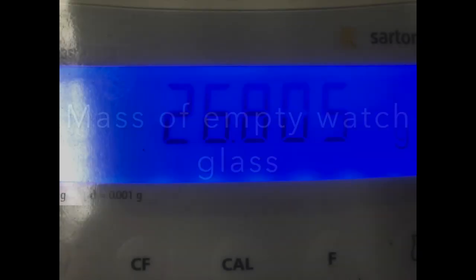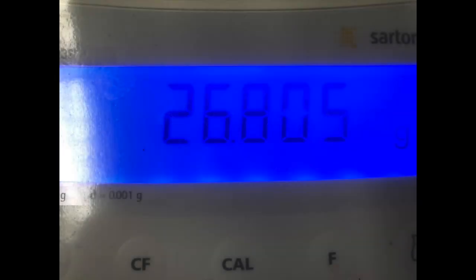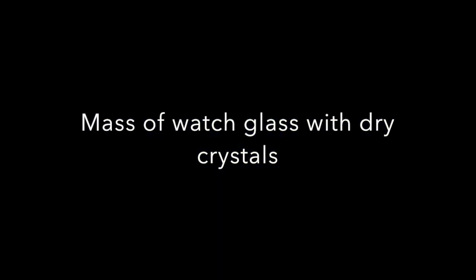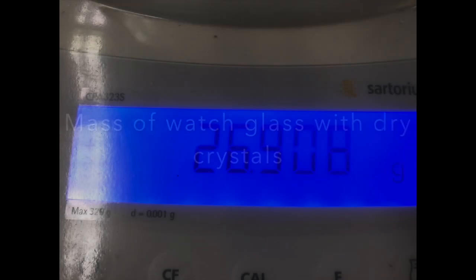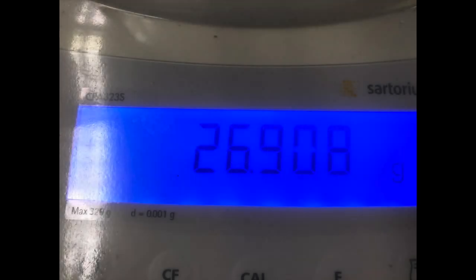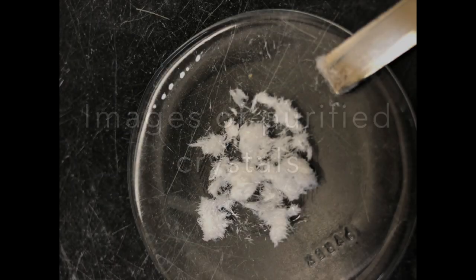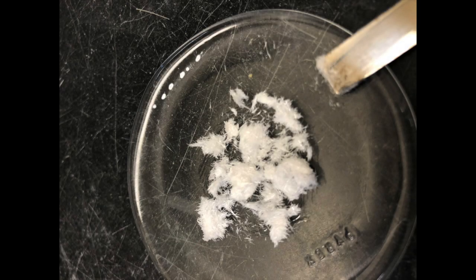We pre-weigh a clean and dry empty watch glass and then add our crystals to the watch glass and re-weigh. The purified crystals look significantly different than the precipitate of the crude product in that they look like small needles have formed.